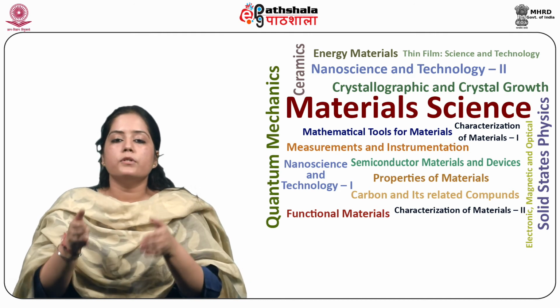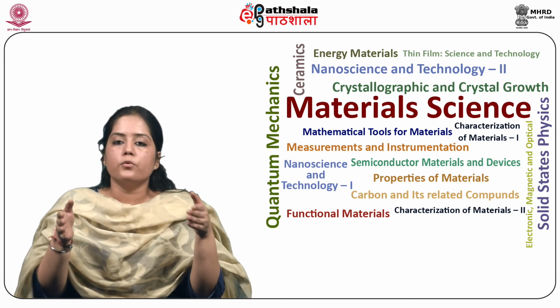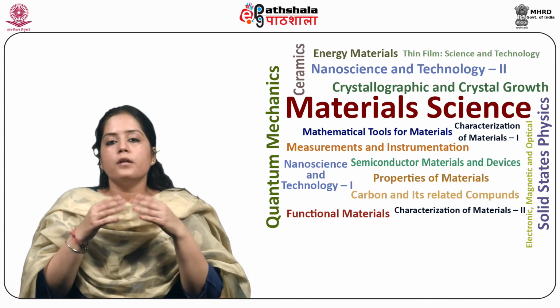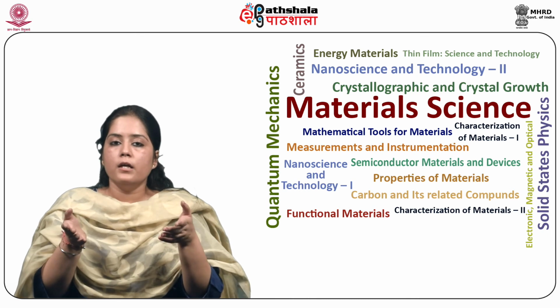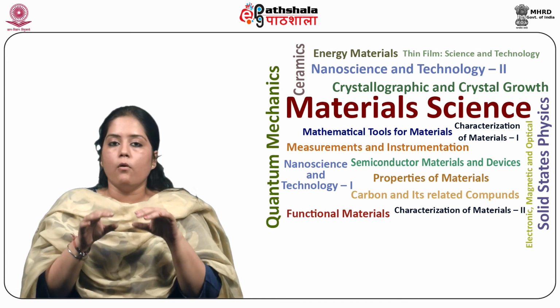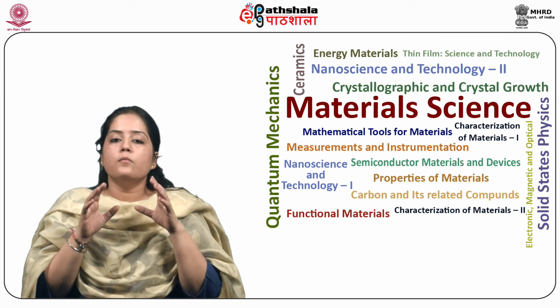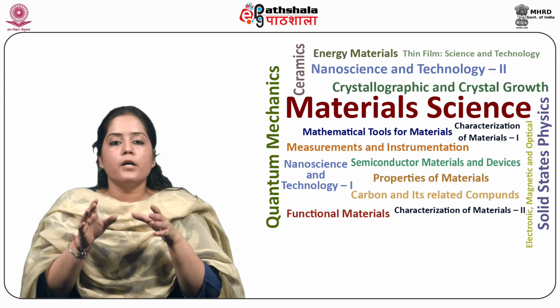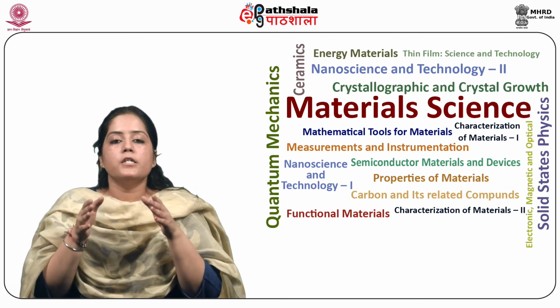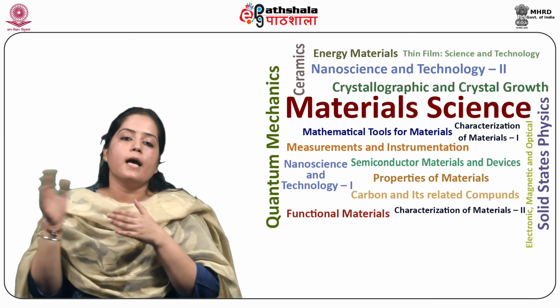A linear photodiode array consists of several small silicon photodiodes created on a single silicon chip. The number of photodiodes can vary from 64 to 4096 sensor elements on a chip. However, 1024 photodiodes is the most common. For each diode, there is also a storage capacitor and a switch. The individual diode capacitor circuits can be sequentially scanned.